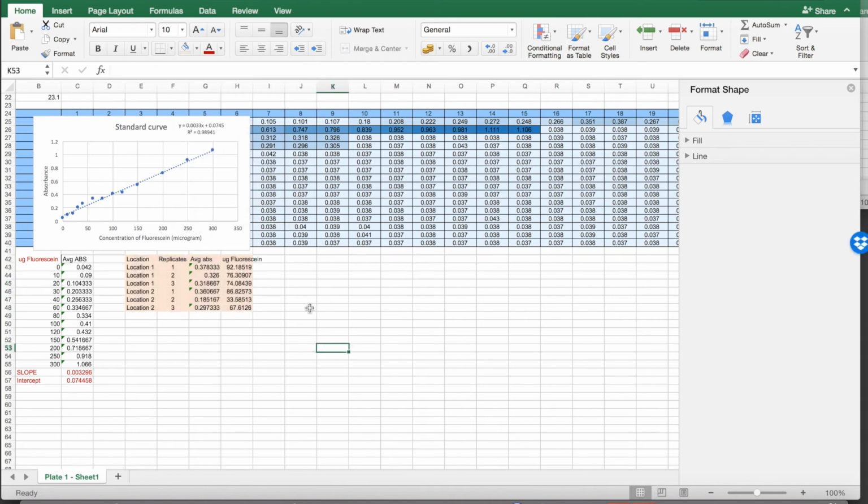All right, so now we're gonna do exactly as we did for the soil respiration. I could end the video here because you could just look into the soil respiration Excel processing, but I'm gonna continue. So I'm just gonna repeat what we did for soil respiration.